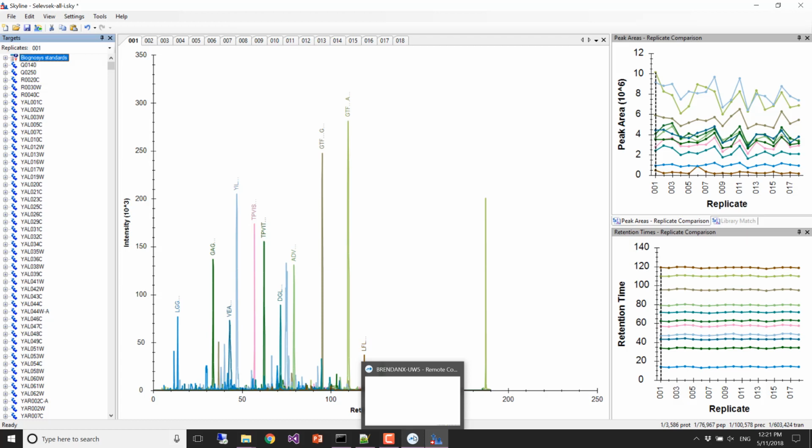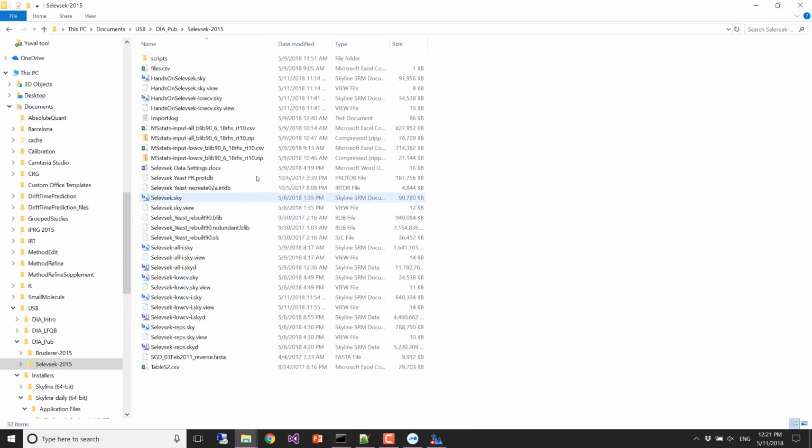All right, cool. Everybody knows how to process data. I'm expecting it's not as memory intensive as this. No, because we've reduced it to these fairly small files. Let's look at the size of the reports. The reports themselves are hundreds of megabytes, but we've been dealing with gigabyte-sized things, right? So I think now we're safe. We're going into R, and we're just going to do quantitative analysis.